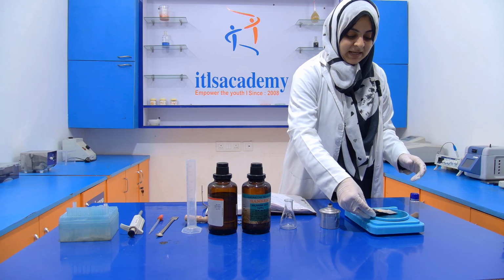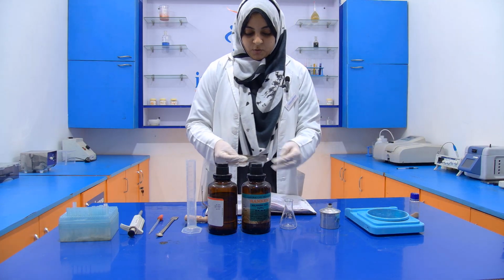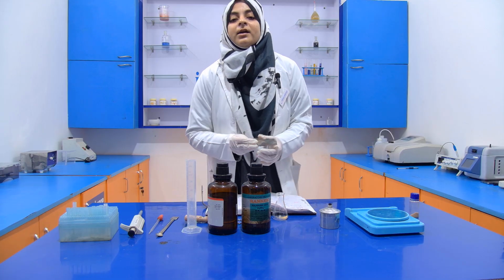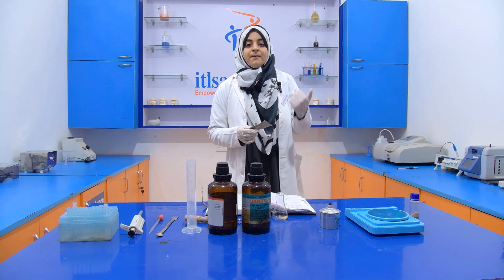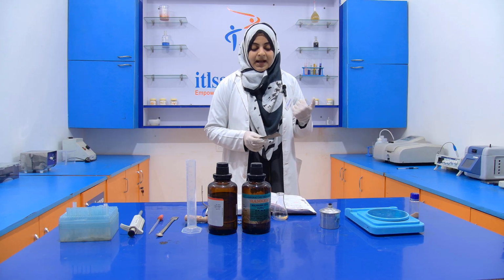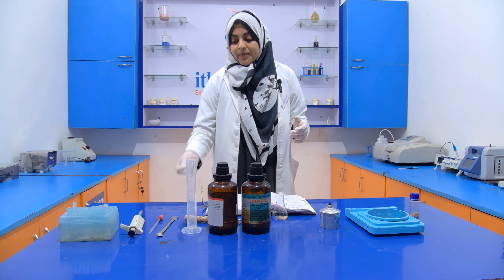Now transfer this asafoetida into the conical flask. Here I choose the conical flask because it will mix the acetic anhydride and the asafoetida properly.